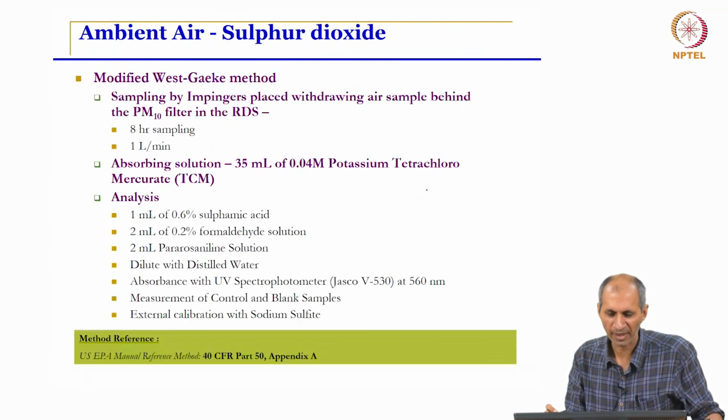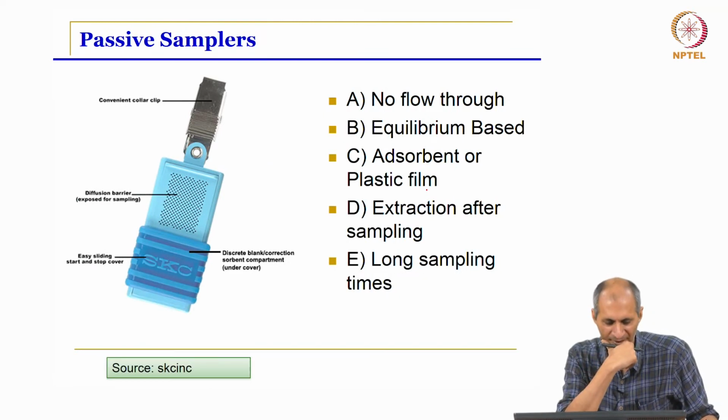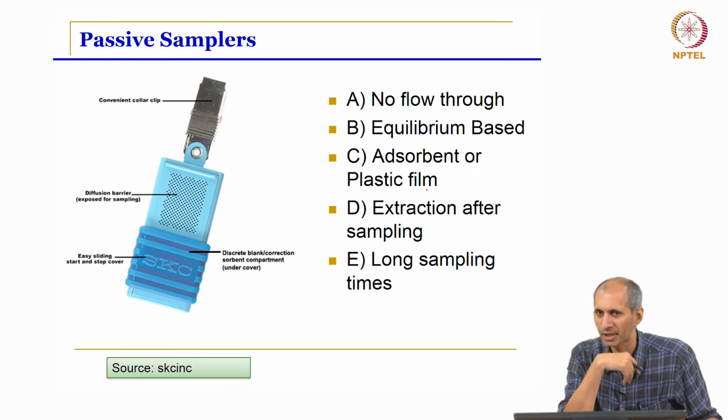So, we will just go over quickly. This is the other type of sampler. It is something called passive samplers. This is a new thing. This is not a standard method, it is still under development.